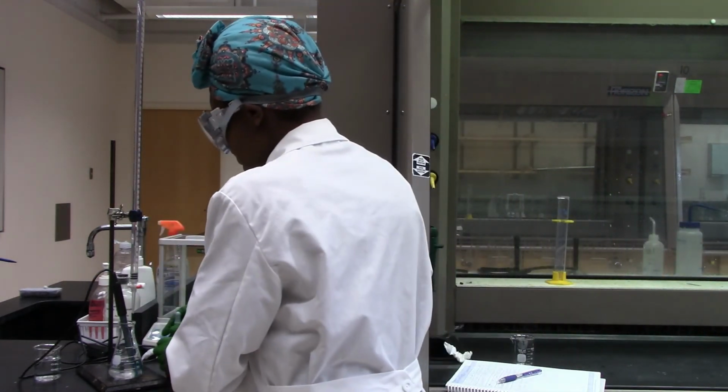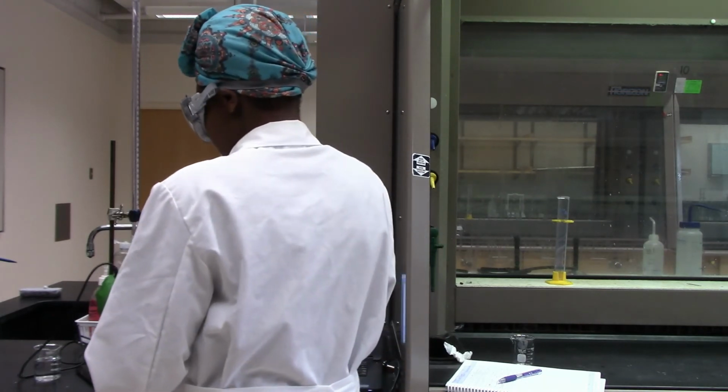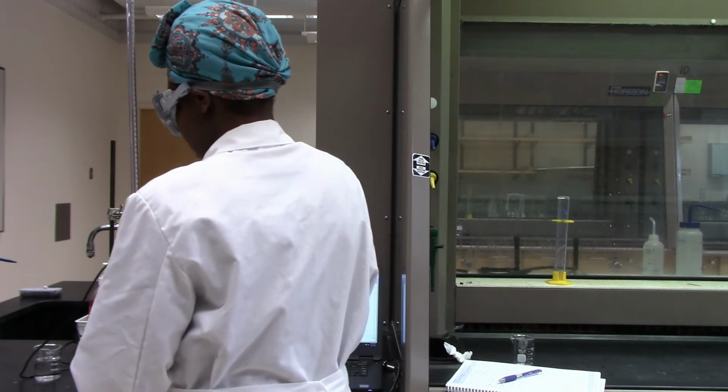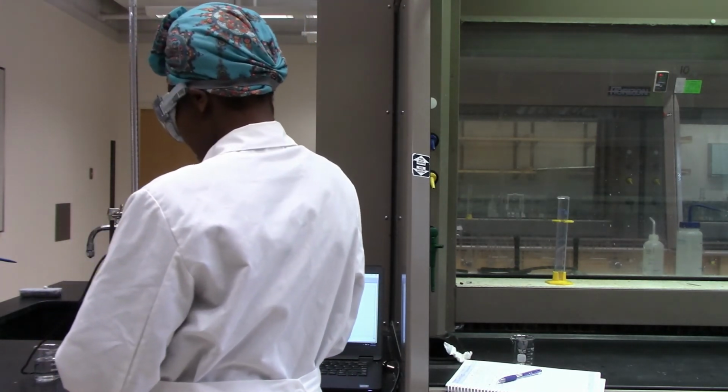Okay, so I will start with, let's say, 1 ml.